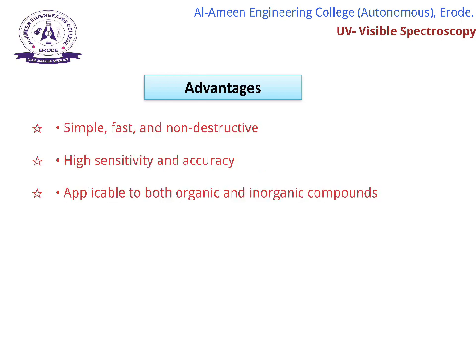Next, advantages. It is a simple, fast, and non-destructive method. It has high sensitivity and accuracy. It is applicable to both organic and inorganic compounds.